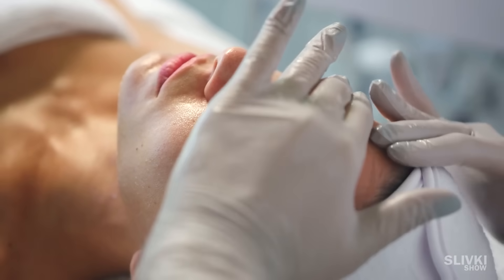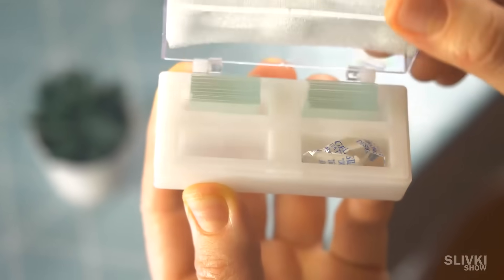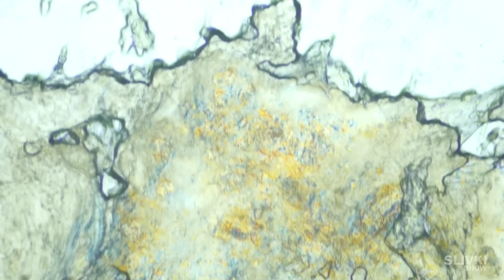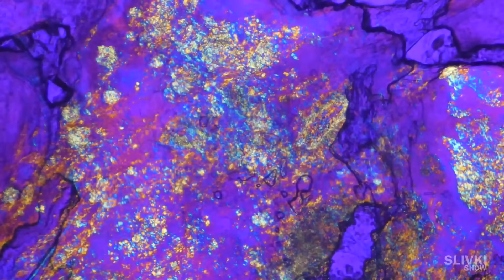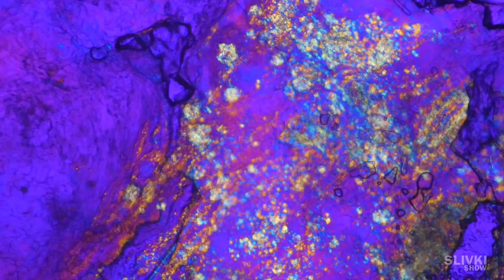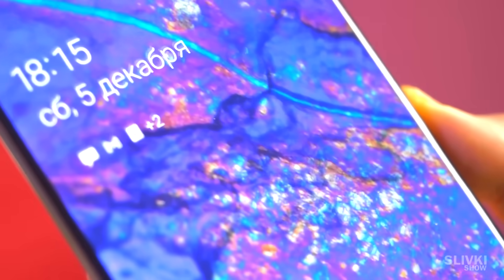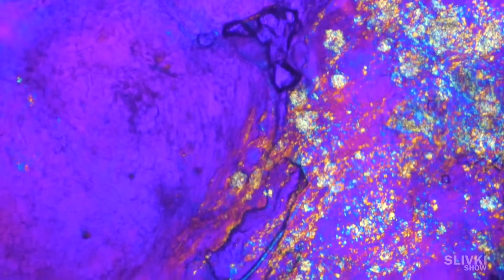A lot of people asked us to show a pimple from human skin under the microscope. You'd think it would just be some round dots of human fat, but since you asked, let's take a look. It looks like transparent plasticine and a medieval map with lakes and countries. But if you turn on a special light, it changes the picture dramatically — look how beautiful it is! It's like some kind of galaxy or a picture of cities from space. So if you didn't like your blackheads before, now you know that actually inside, they're beautiful.